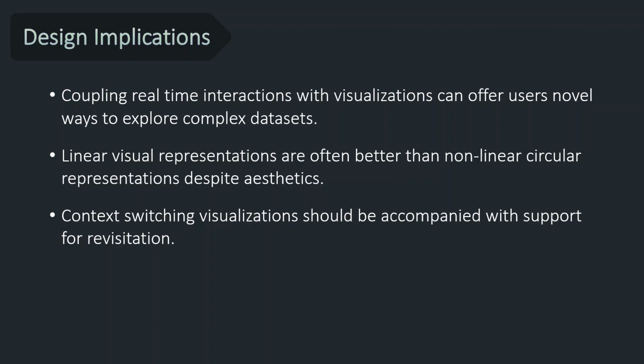In developing our system, we were able to surmise some design implications which we believe can also be used to inform other research in this design space. The first implication is that in visualizing complex genomic datasets, overloading of visual variables can be avoided by simply utilizing interaction techniques to bring up details on demand when necessary, or present them in a tiered manner that can be interactively navigated.